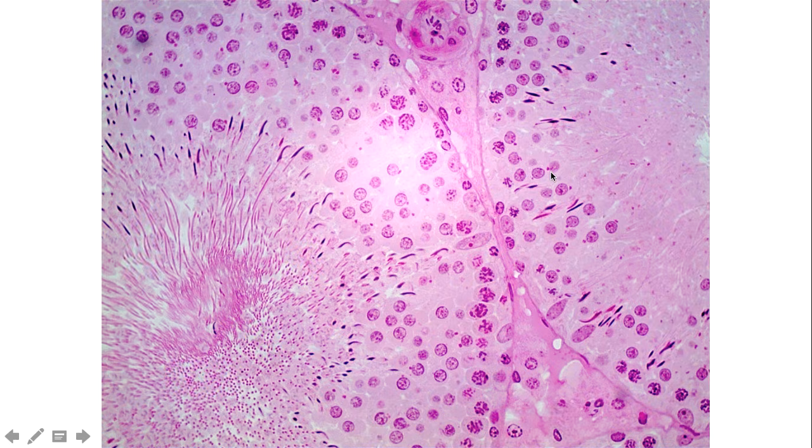And these are the cells that create the blood-testis barrier, the tight junction between them, as well as producing nourishing fluid into the lumen that will help nourish and support these developing spermatozoa. So the sustentacular cells we can see by these large columnar nuclei with very prominent nucleoli, whereas all the other cells in here are just developing spermatocytes at various stages of development.